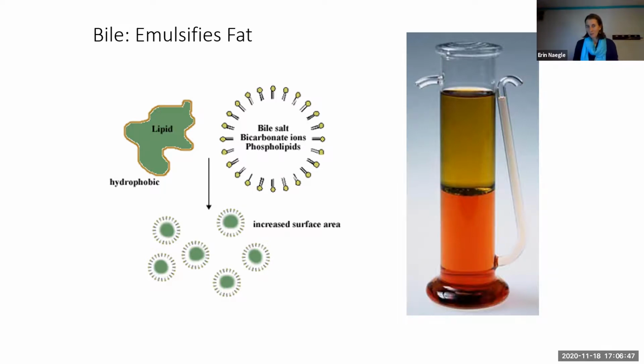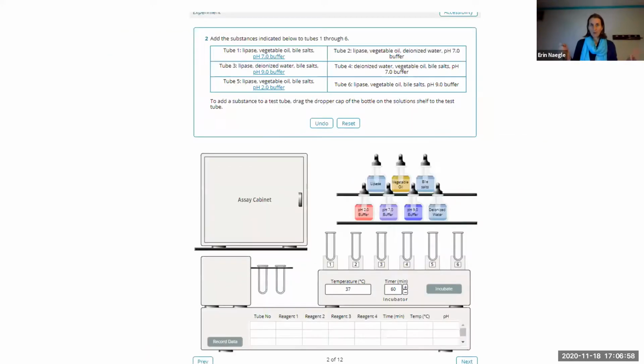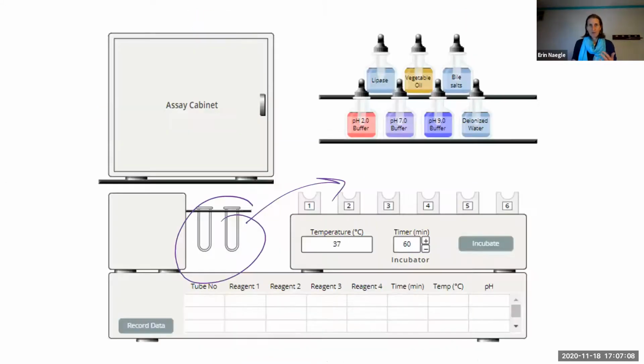That's the background. Here's what the lab looks like. You will start this way, and then we'll have you move some of those test tubes into the test tube rack. Voila. And once you do that, you're going to get this chart that is going to have you set up a bunch of treatments. Now let's go back here. What have you got here? You've got lipase. Okay, so what's that? Yeah, that's your enzyme. So that's actually going to do the reaction. I'm going to see if I can improve my handwriting here. Get a different pen. Blame the pen.